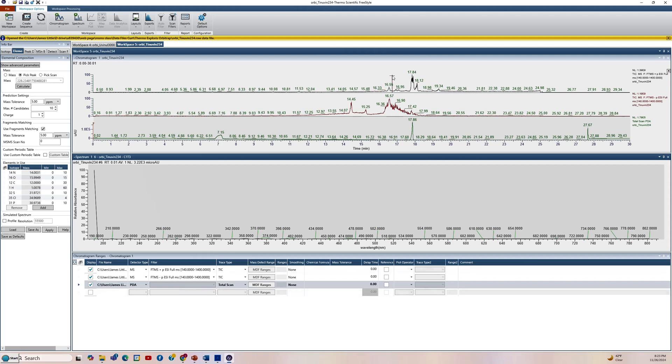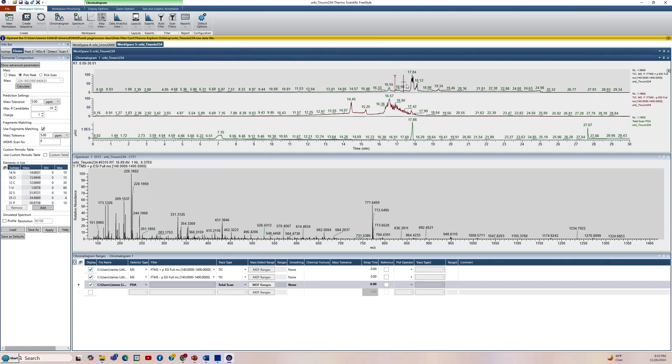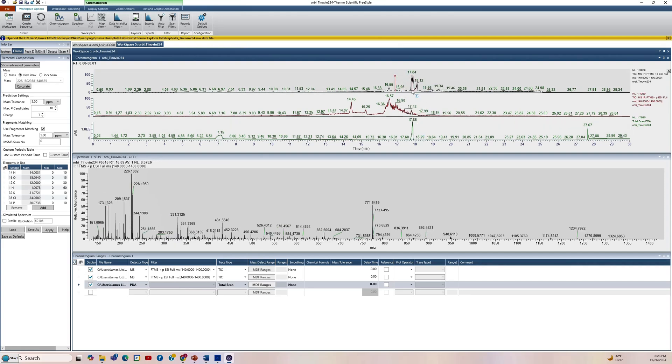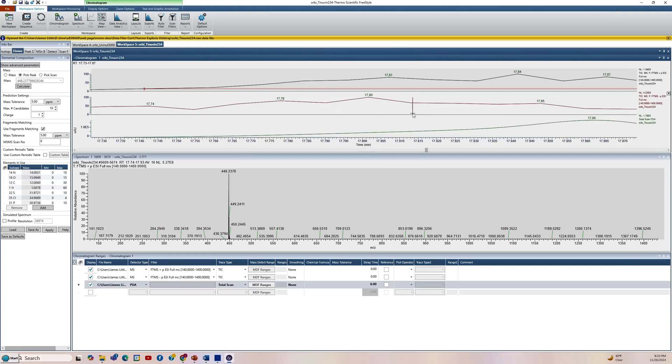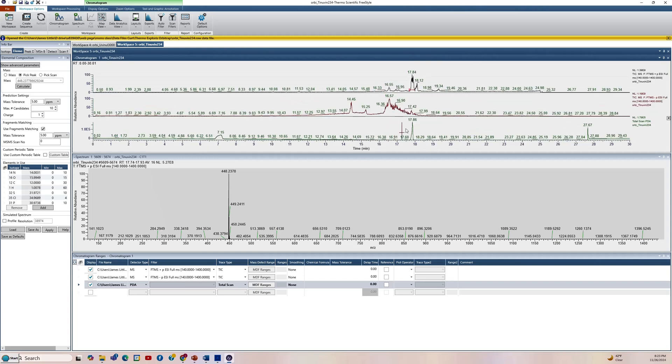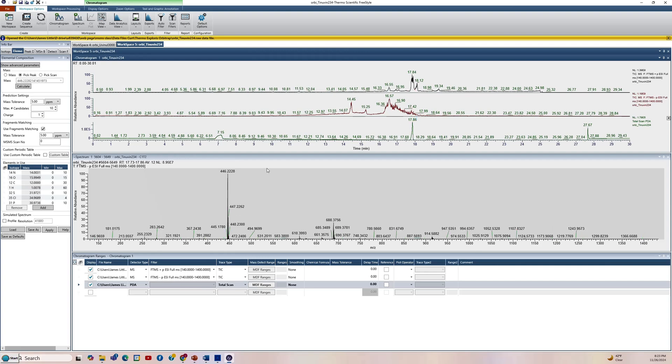So you can click on this if you want to and average it to see if it looks consistent across it. Average spectrum. Looks good. It weighs 447. So we've got a nice M plus H at 448. We go to the negative and do the same thing. Zoom. Average across it. Right click, average spectrum. Click and drag. You can see the 446 for the M minus H.